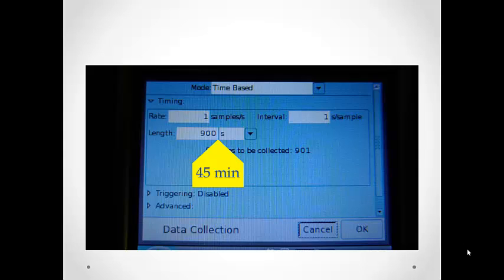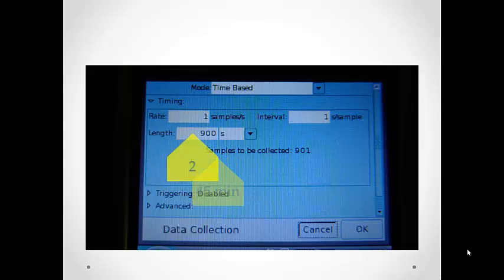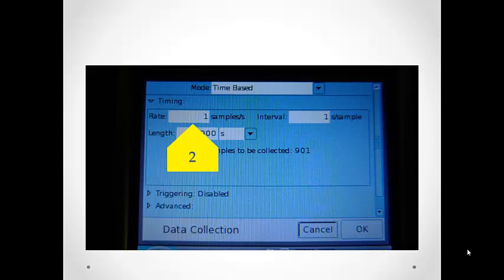Now this is much longer than the time it will take you to actually do this lab, but we want to have a cushion. We also want to take a data point every 30 seconds. So change the interval to two samples per minute.